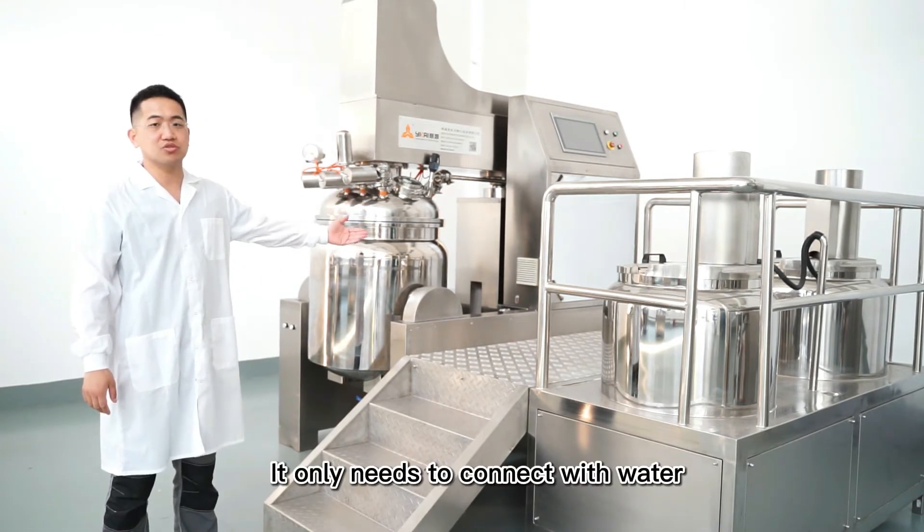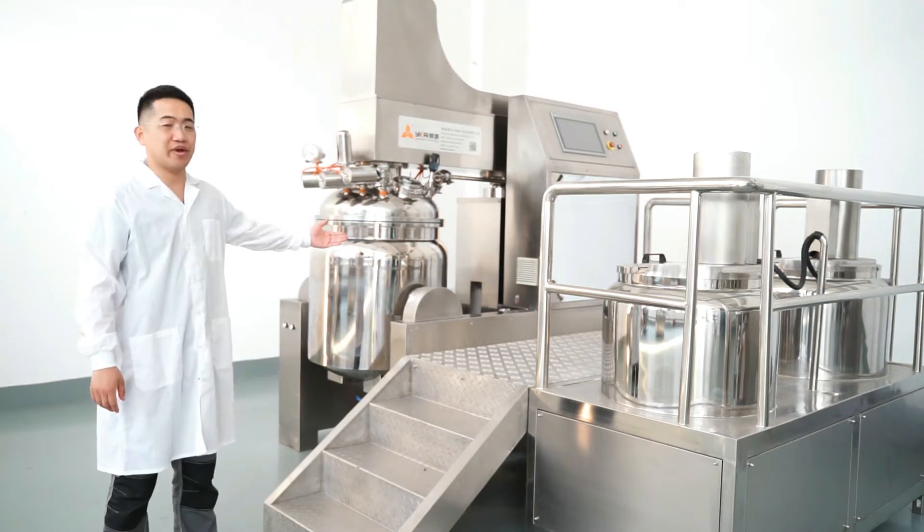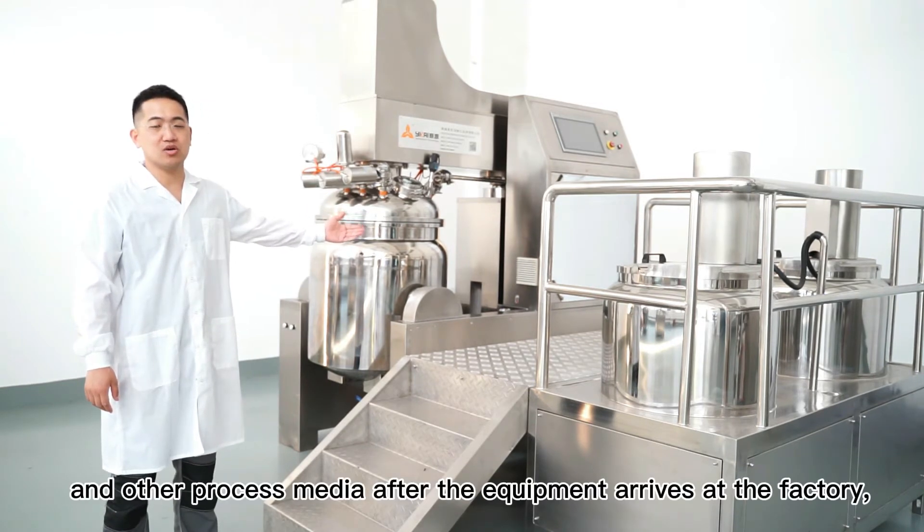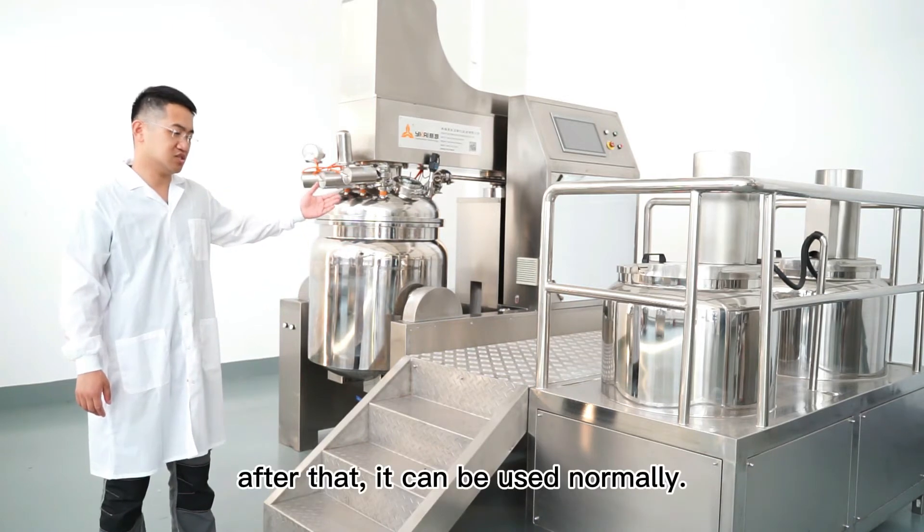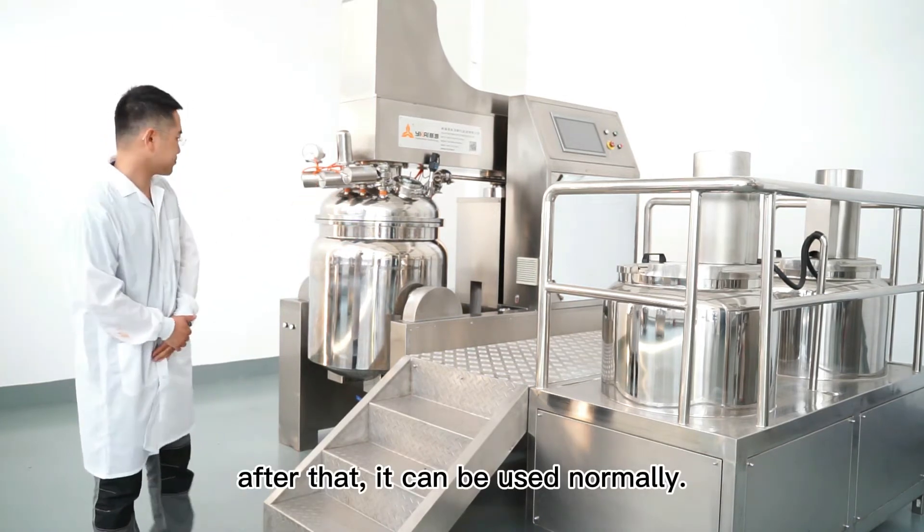It only needs to connect with water and other process media after the equipment arrives at the factory. After that, it can be used normally.